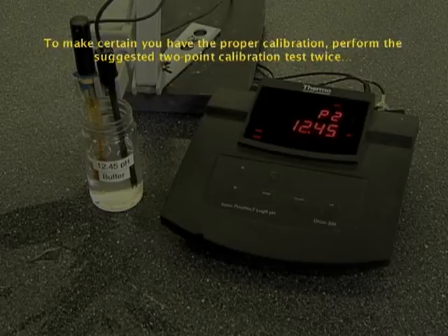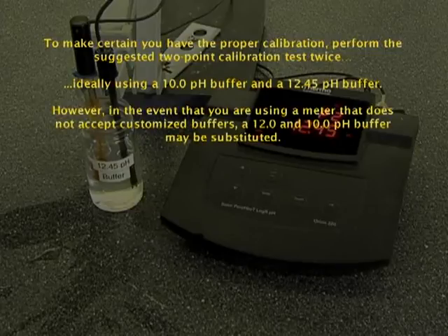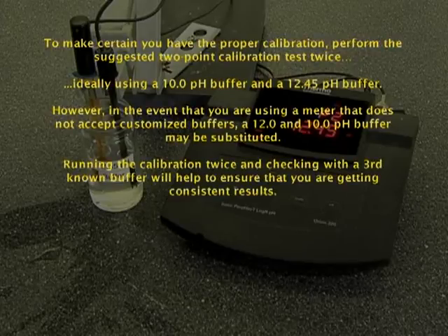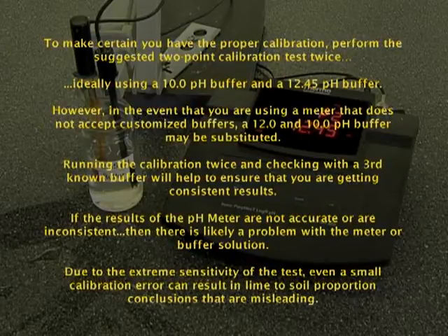To make certain you have the proper calibration, perform the suggested two-point calibration test twice, ideally using a 10.0 pH buffer and a 12.45 pH buffer. However, if you are using a meter that does not accept customized buffers, a 12.0 and 10.0 pH buffer may be substituted. Running the calibration twice and checking with a third known buffer will help ensure consistent results. If the results are not accurate or inconsistent, there is likely a problem with the meter or buffer solution. Due to the extreme sensitivity of the test, even a small calibration error can result in lime-to-soil proportion conclusions that are misleading.